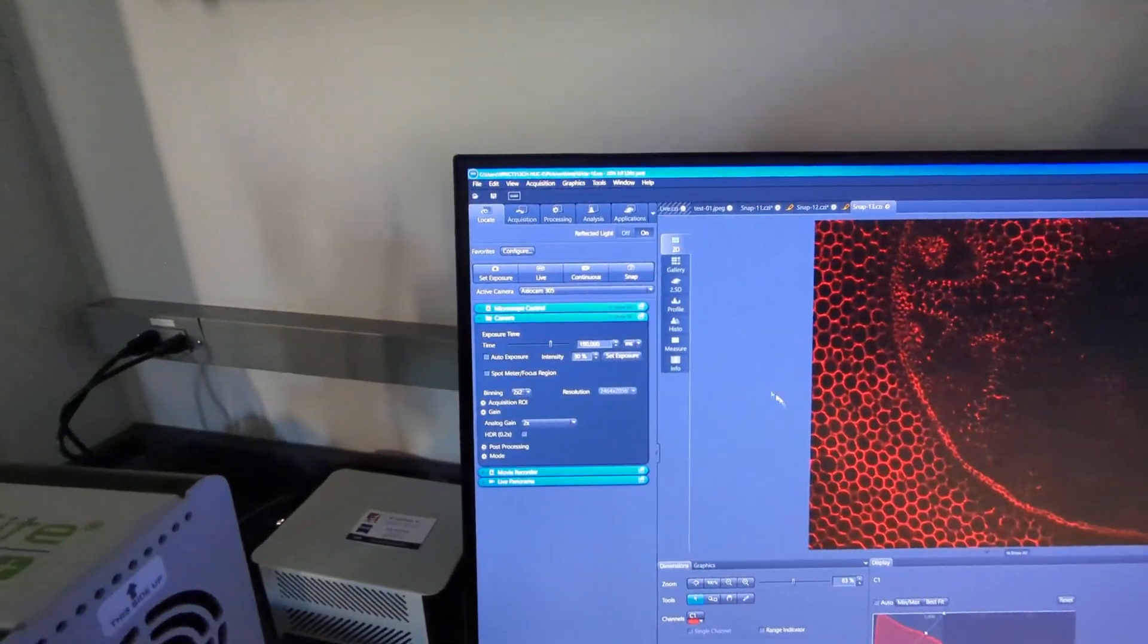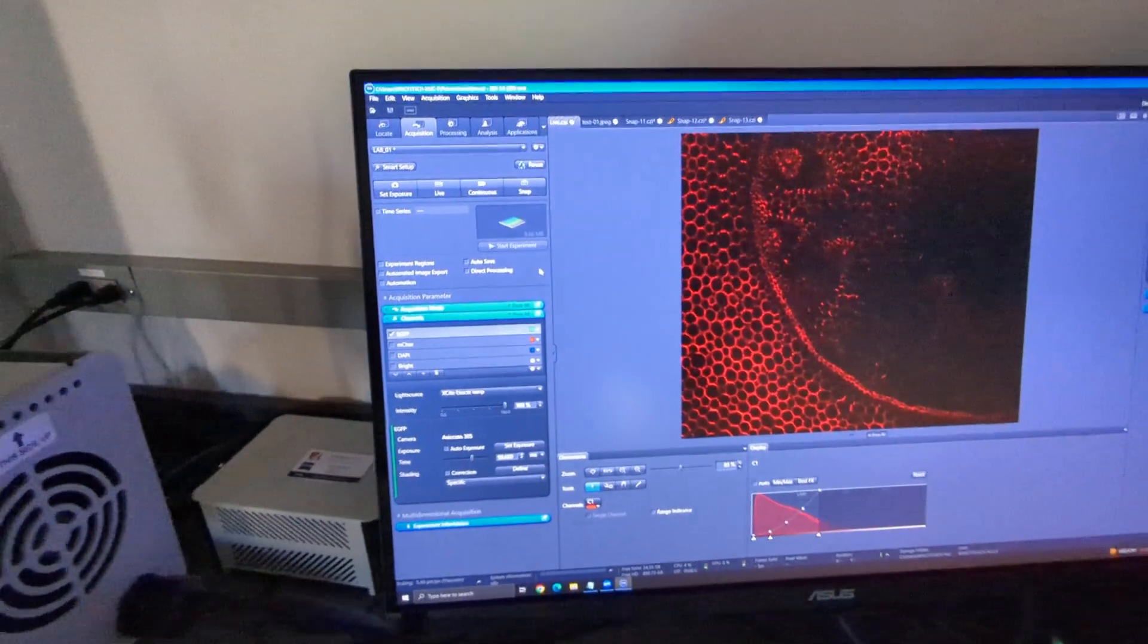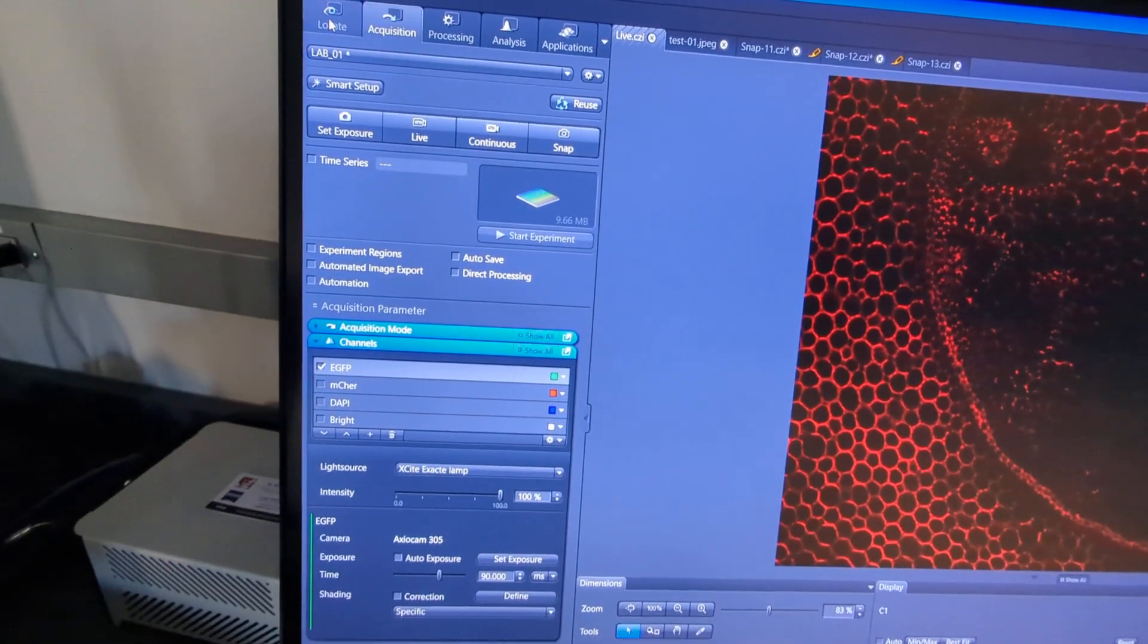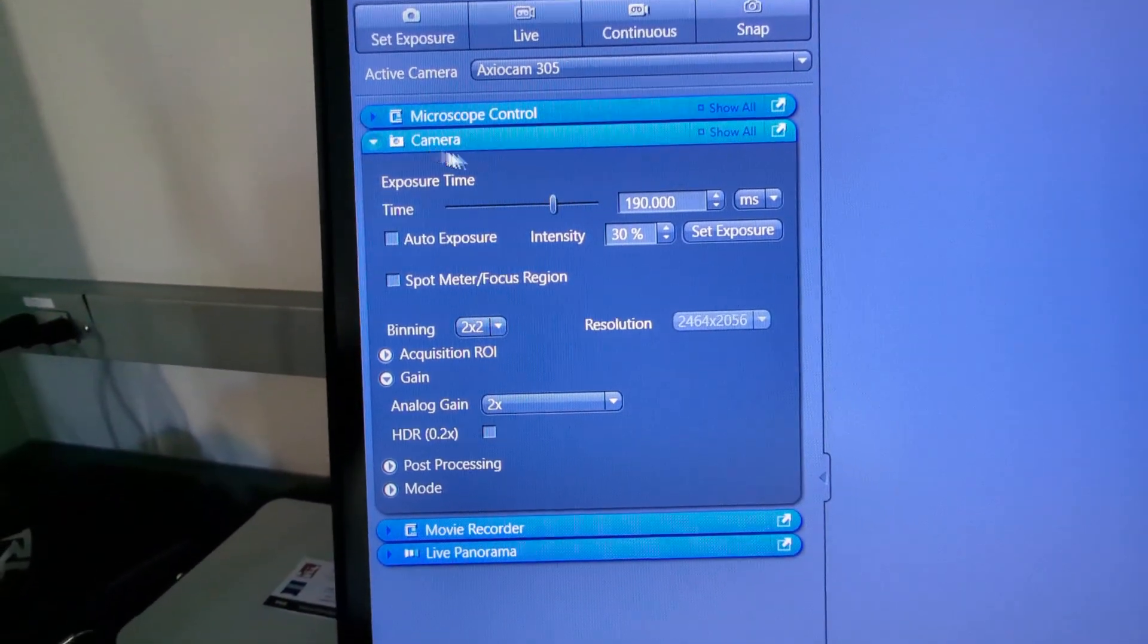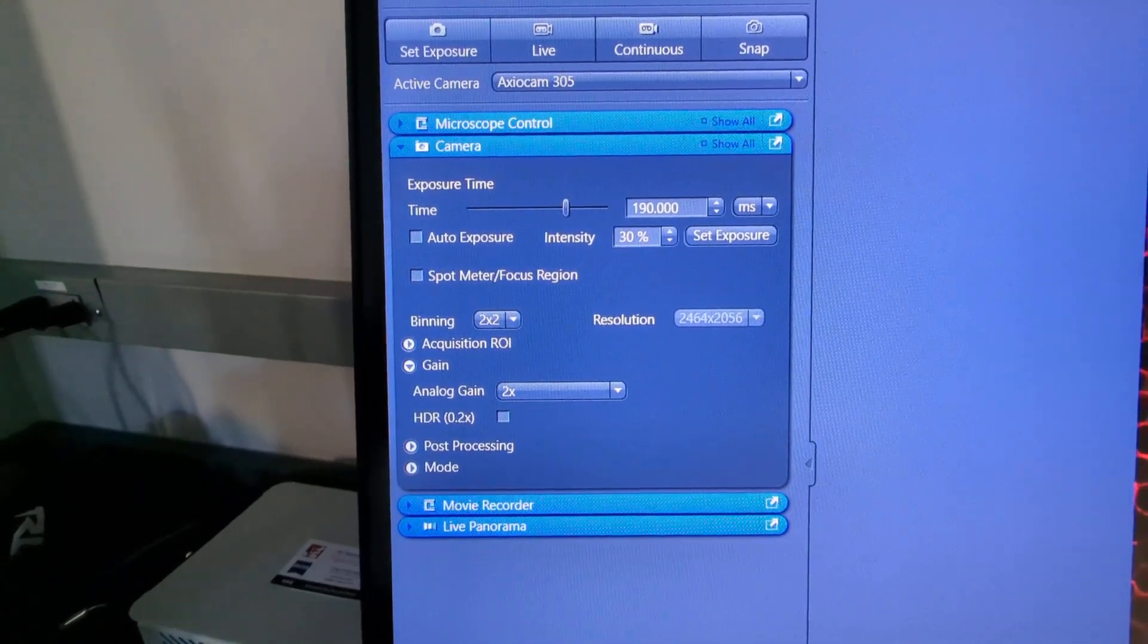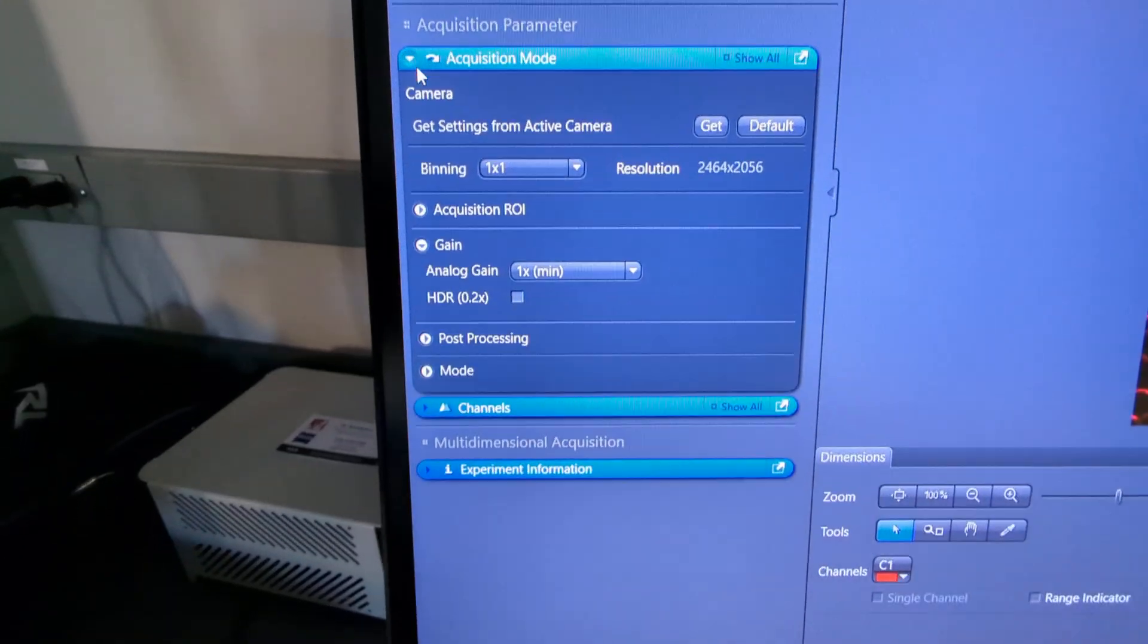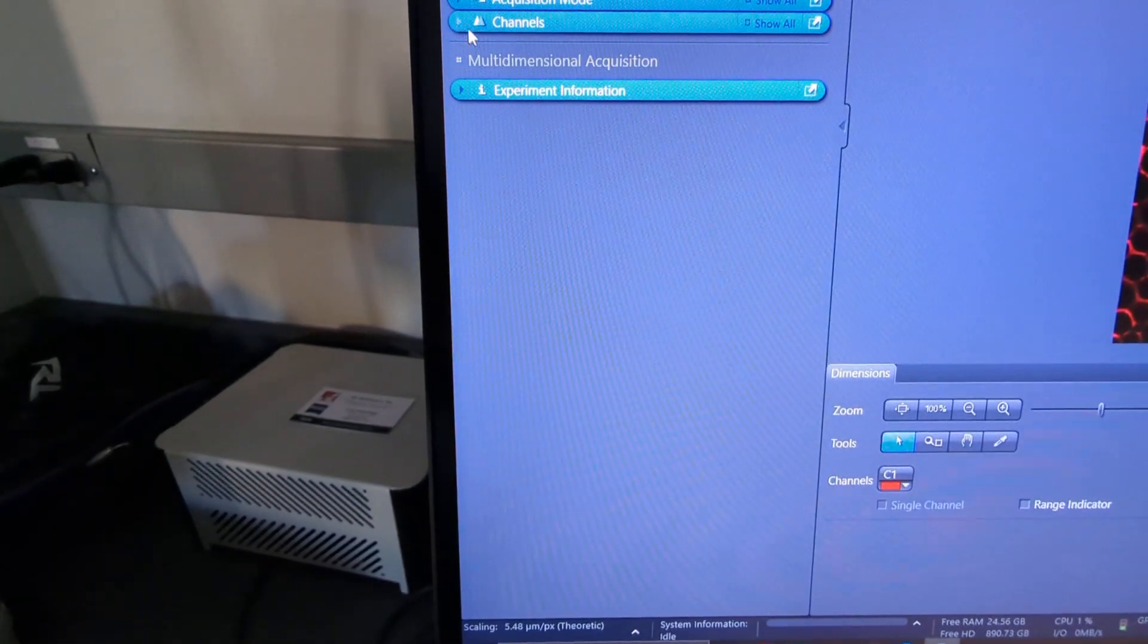Now let's go to the acquisition tab. It's a little bit different here. Instead of like on the locate tab where it had this camera window with all of those features in it, on the acquisition tab it changes to an acquisition mode which has the binning and the gain, but then your exposure is under the channels tab or window down here at the bottom.